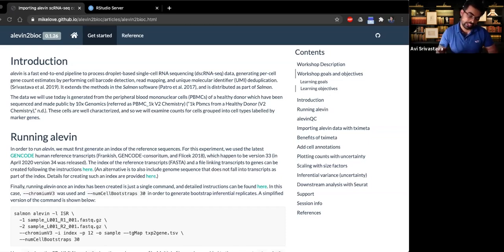So what specifically does Alevin bring? If you look at CellRanger, when it starts to generate the gene versus cell count matrices, it looks for reads which multi-map across genes, and if they multi-map, it just throws them away. That's basically what every other pipeline out there does. So what if you could use those multi-mapping reads in a principled framework and generate gene versus cell count matrices without throwing away a quarter of your data set?